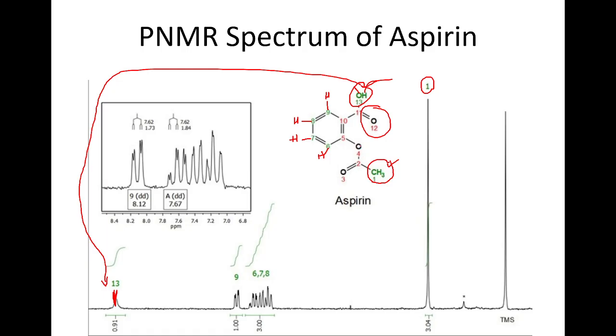Then we go to the other easier one, number 1, which is that one. Look, there is no hydrogen here. There's no hydrogen there. So there is no neighbor for this hydrogen. These 3 together are all chemically equivalent. Imagine they are 3 boys. They are the same. Or 3 girls. They're the same. If they are 3 boys, there are no girls next to them.